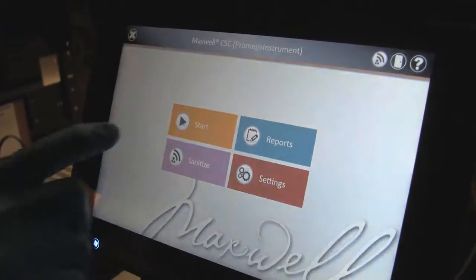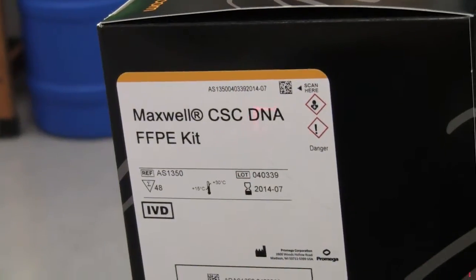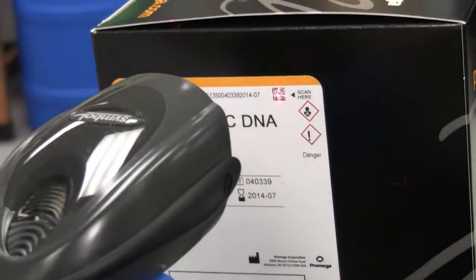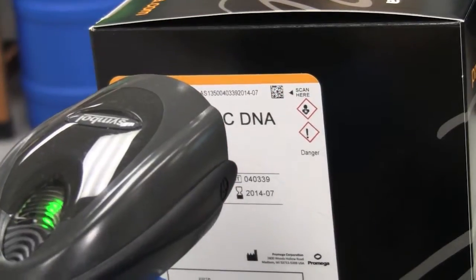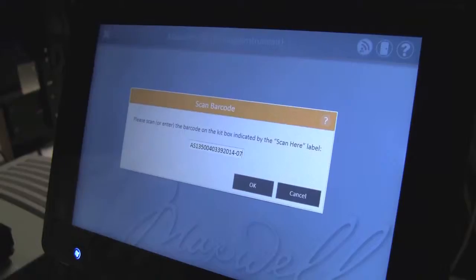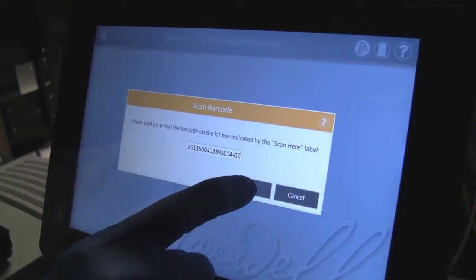Select Start on the home screen. Scan or enter the method barcode on the Maxwell CSC DNA FFPE kit label to automatically select the method to be run.